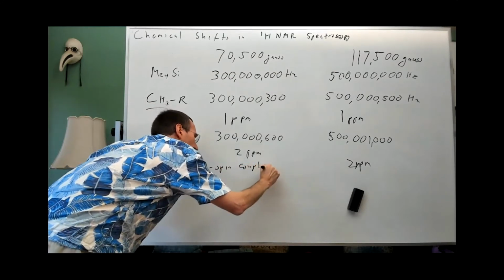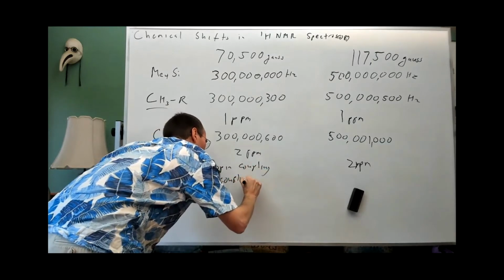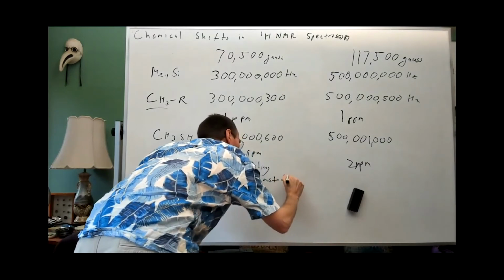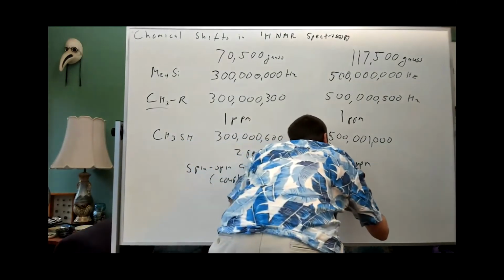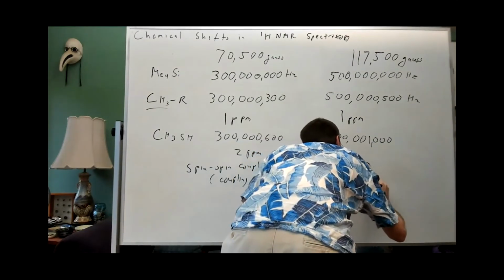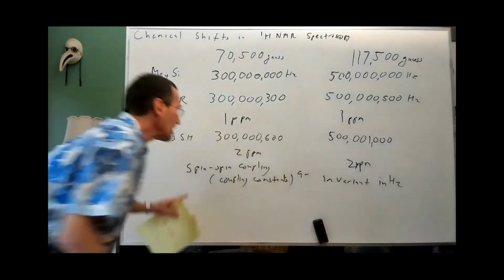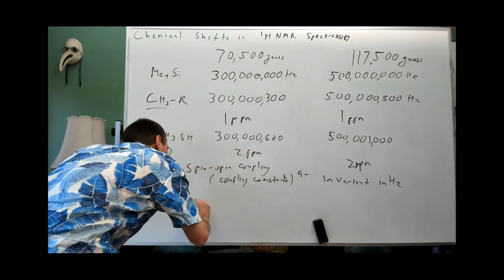In other words, coupling constant, but the chemical shift is invariant in ppm.